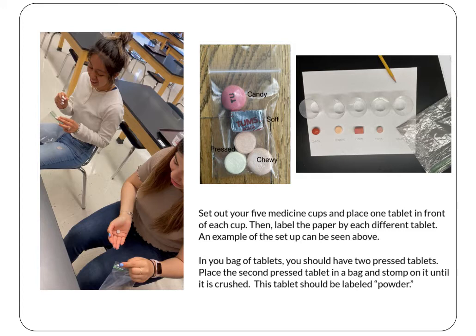The soft tablet will need to be unwrapped and should be labeled soft on your paper. The chewable tablet should be labeled chewable, and the candy-coated tablet should be labeled coated. Then, take one of your pressed tablets and label it pressed.